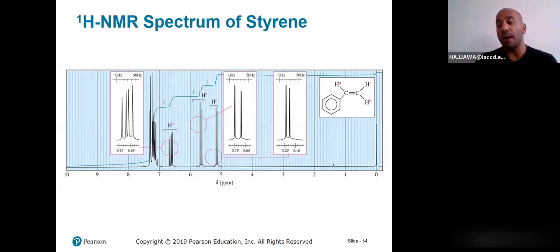But because the coupling constant plays a role in figuring out whether that hydrogen is surrounded by a cis hydrogen or a trans hydrogen, I will see different peaks for those 2 hydrogens, even though they are on the same carbon. What I'm trying to say is that you will see a peak for HC different than the peak for HB. How come? HA will be affected by the 2 hydrogens differently, meaning HA will read HC differently than HB. That's why you see a doublet and a doublet.